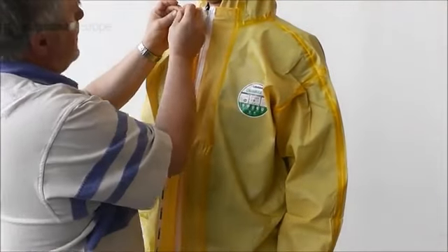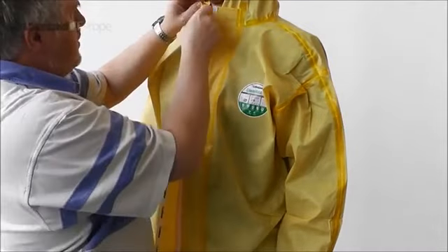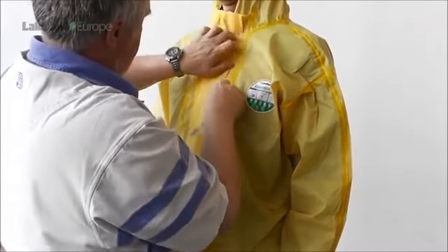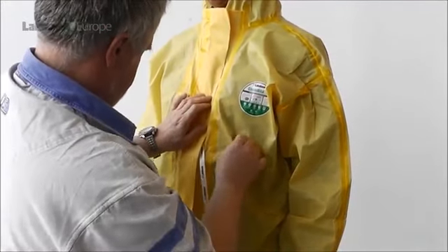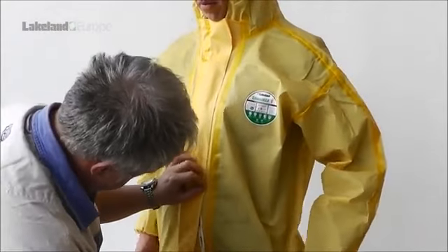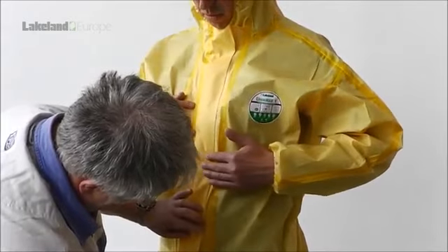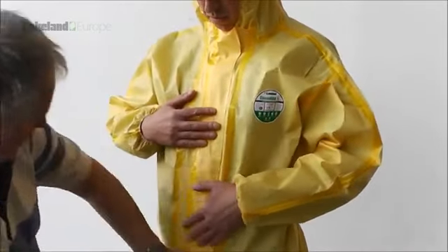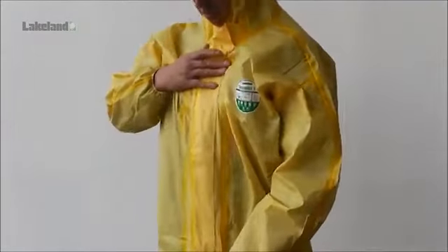Once the hood is in position and comfortable, the outer flap tape can be sealed. Lakeland Chemmax garments feature an adhesive tape to the outer flap for additional security. Carefully peel off the tape backing from the top and part way down the flap. Fasten the top of the flap first and carefully press the flap into place, moving gradually down the garment and peeling off the remaining backing. Ensure there are no creases or folds that might offer a gap for penetration of a liquid.